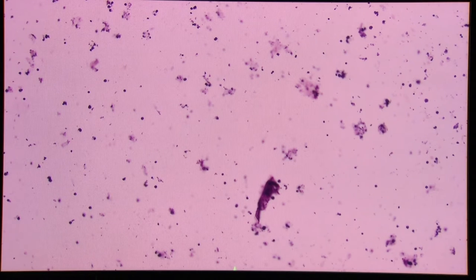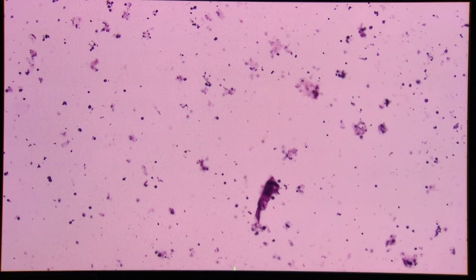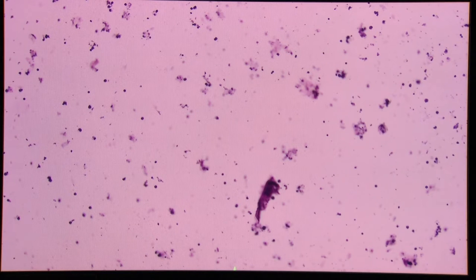Now we're going to look at our microscopic urine sediment. We use SETI stain and unstained urine sediment. The SETI stain helps identify cells and sometimes helps look for casts as well because the casts will pick up a little bit of stain.